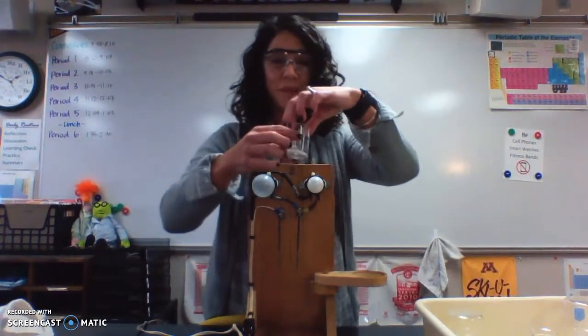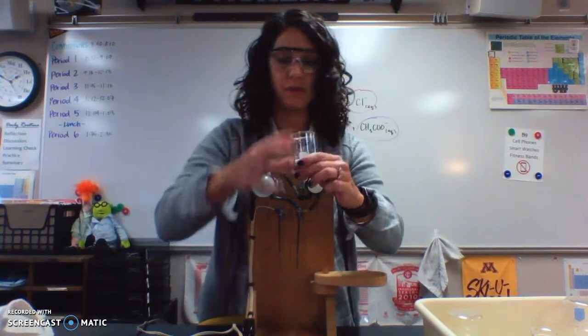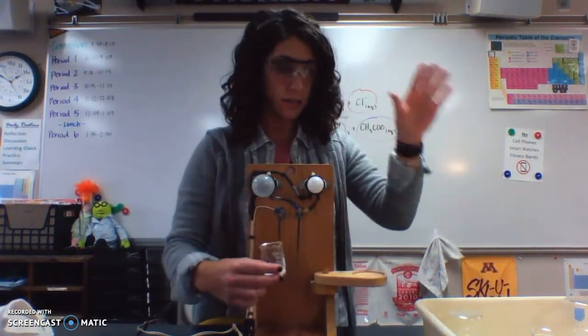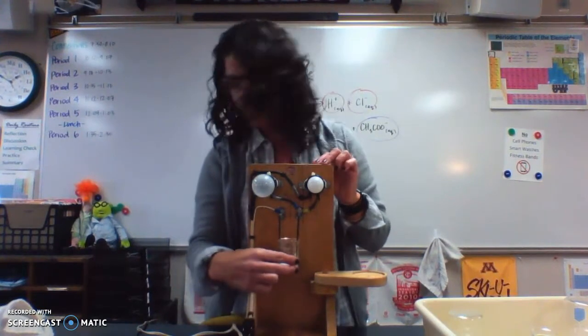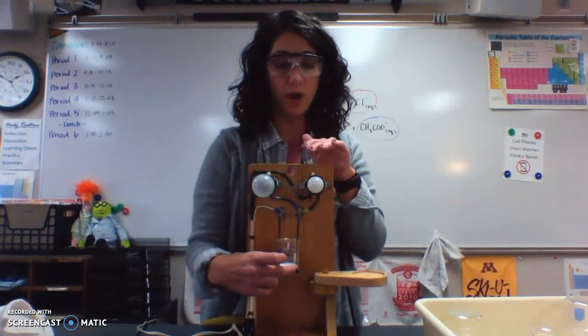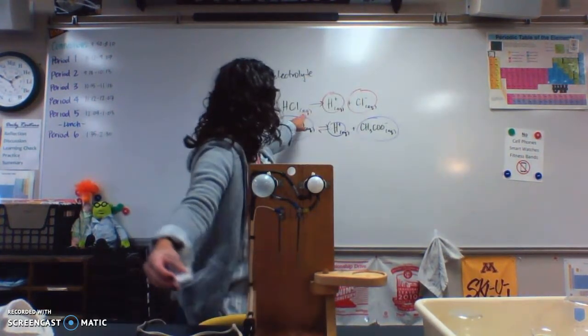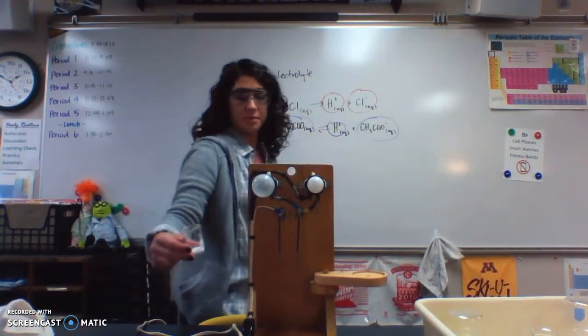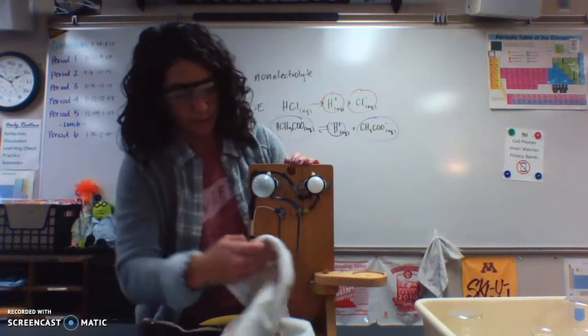All right, here I have just solid salt crystals. So no water in this one. Salt dissolved in water dissociates as a strong electrolyte. Plugged it back in, but solid salt by itself, no water, does not dissociate. Remember, it has to be aqueous for this to happen. So solid salt, nothing. All right, make sure this is clean.